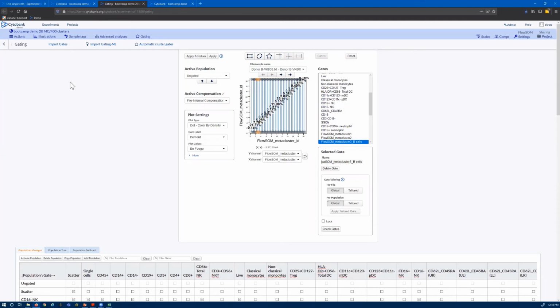So if you see that you have multiple metaclusters that look like each other, so you think you've got too many metaclusters, and you try to decrease your metacluster number, the algorithm might not make the same decision that you would. So if you want to incorporate your prior knowledge, which can be really useful, then I would merge them.